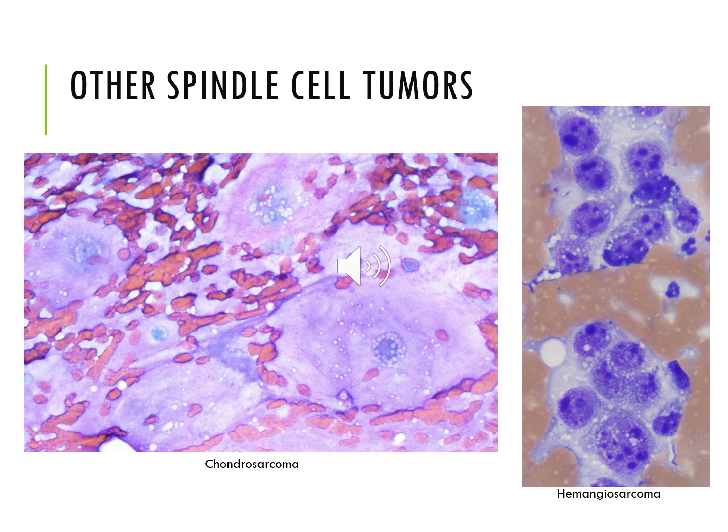I wanted you guys to have a picture of what it would look like. And so what you have here are really atypical spindle cells that have indistinct cell borders. There's pretty marked anisocytosis, anisokaryosis. There's multiple nucleoli of different sizes scattered throughout, and they just look really bad.